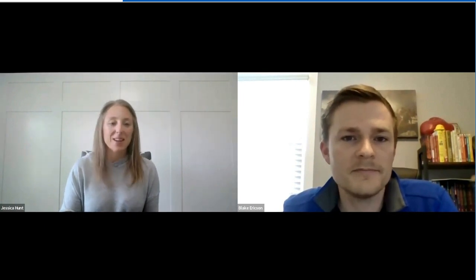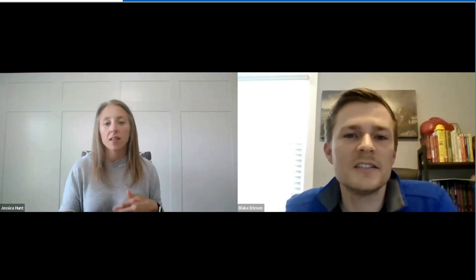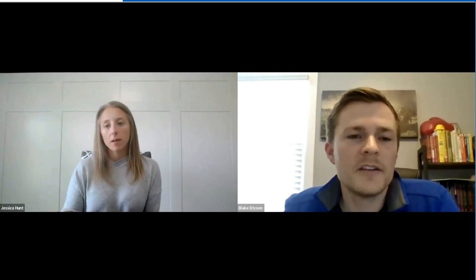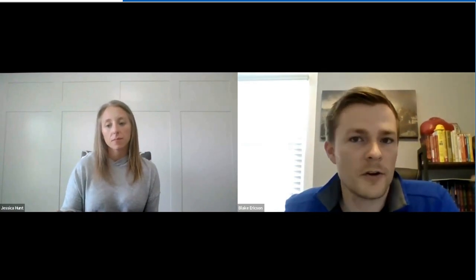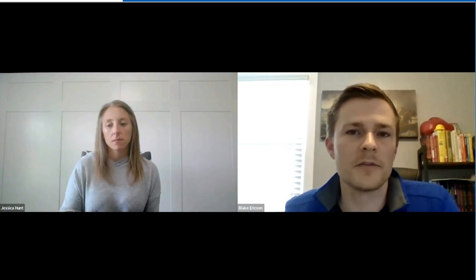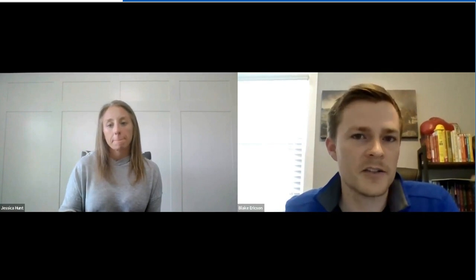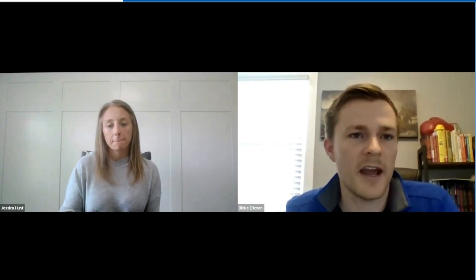So it's not impossible. Heard that term before. So can you take us through what a typical validation process will look like? Typical validation process is based off of the firm. We strongly suggest that as you're collecting data, your field teams, your chemists, your FTIR spectroscopists, whatever you want to call them, your operator, they're consistently checking their recipes and their data as they're going along to make sure that it's accurate and precise.